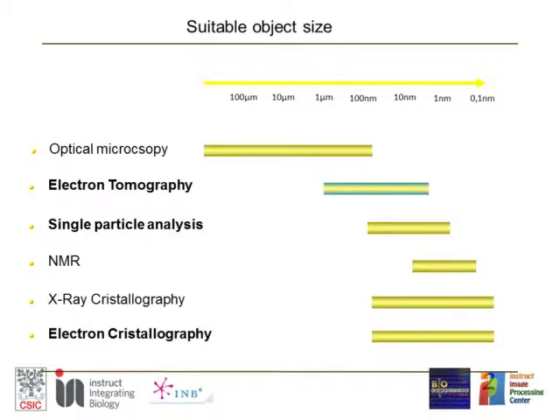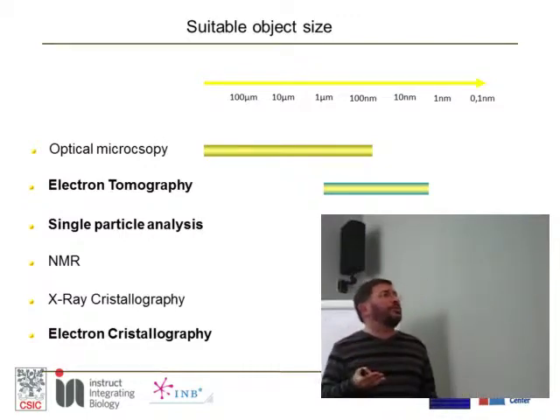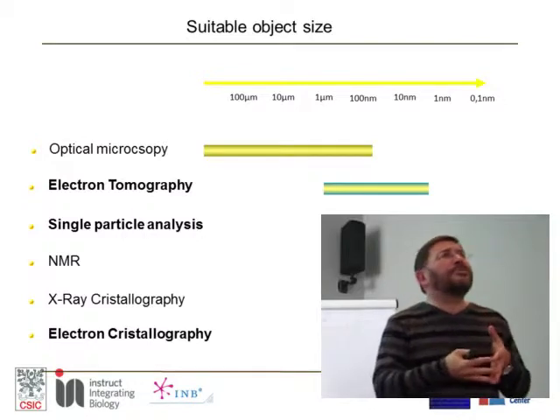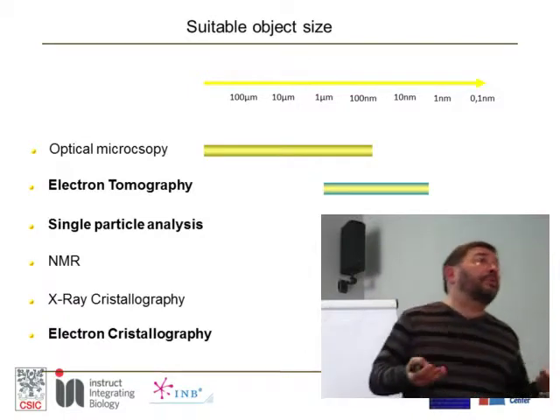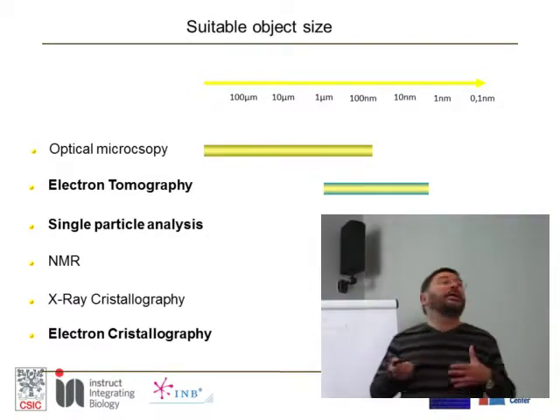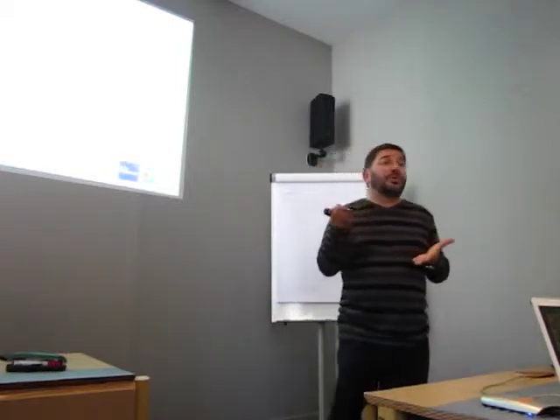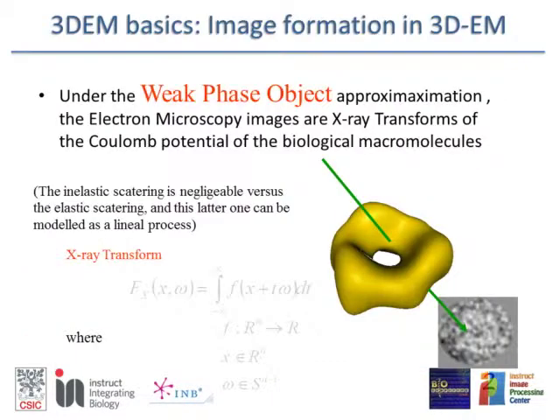I just mentioned that there is another area of electron microscopy research called electron crystallography. That is very simple. You know all the X-ray diffraction work in which they need 3D crystals. This is complicated. What if some types of macromolecules are more comfortable in a two-dimensional environment? They may make 2D crystals, typically membrane proteins. So if we have membrane proteins and 2D crystals, we have what we call electron crystallography, which makes the connection between crystallography, where they need 3D crystals, and electron crystallography, in which we need 2D crystals. And we need 2D, and we cannot have 3D, because of the same thing: matter absorbs electrons, and if you put in too much matter, you don't have electrons at the end of the specimen. So basically, this is the context of the resolution and the sizes we are going to have.